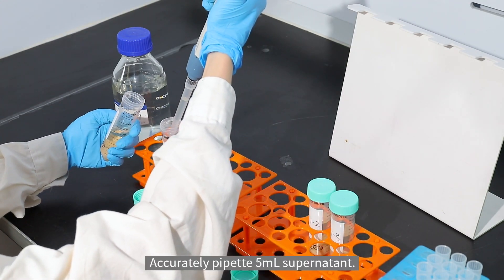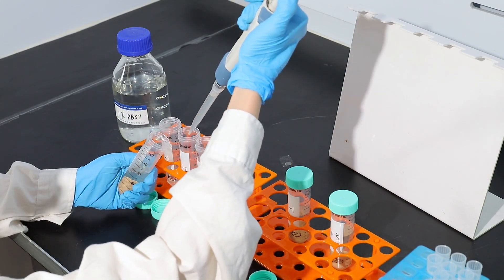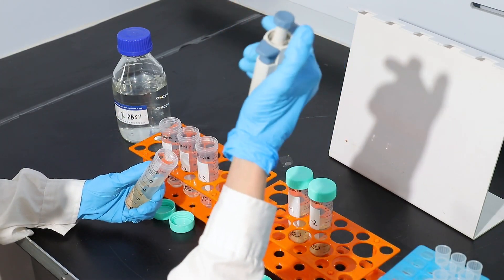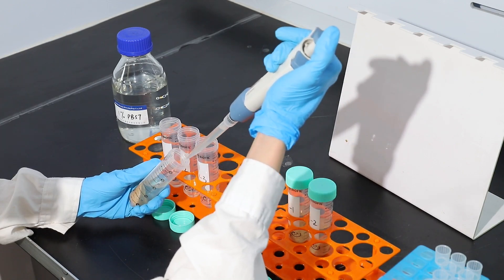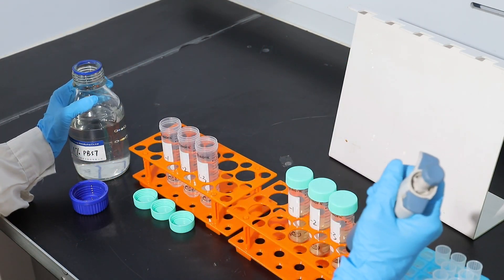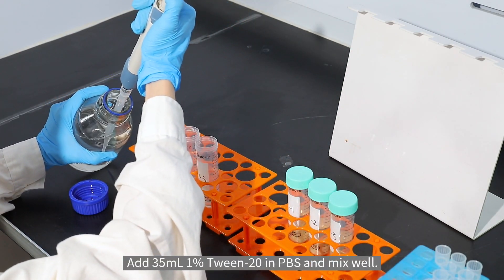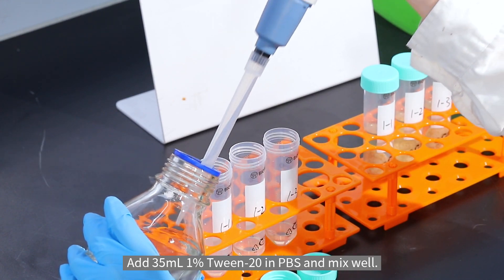Accurately pipette 5ml supernatant. Add 35ml 1% tween 20 in PBS and mix well.